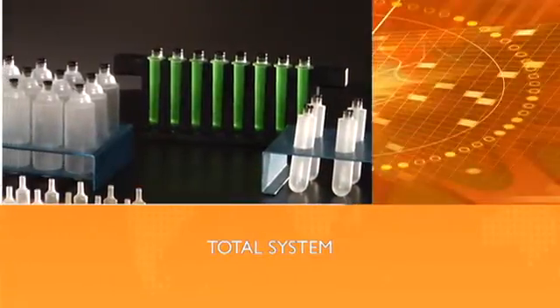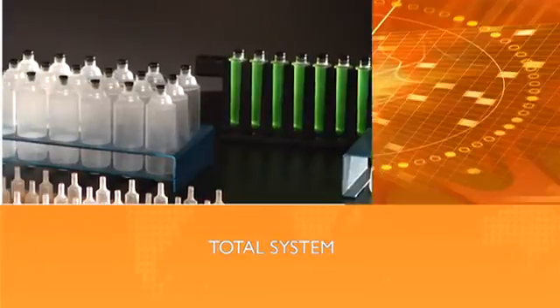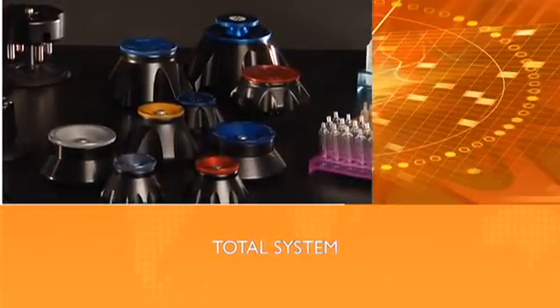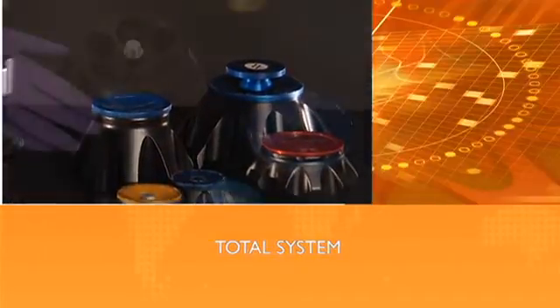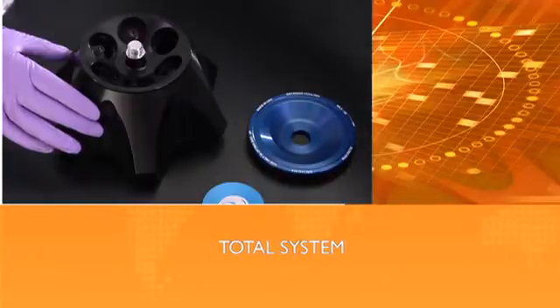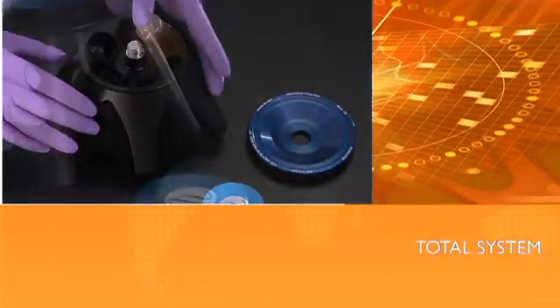Unlike other tabletop ultracentrifuges, the Optima Maxx series delivers a truly integrated system. Its instruments, rotors, and labware are designed, manufactured, and tested by Beckman Coulter as a total system to ensure optimal performance and safety for your lab.